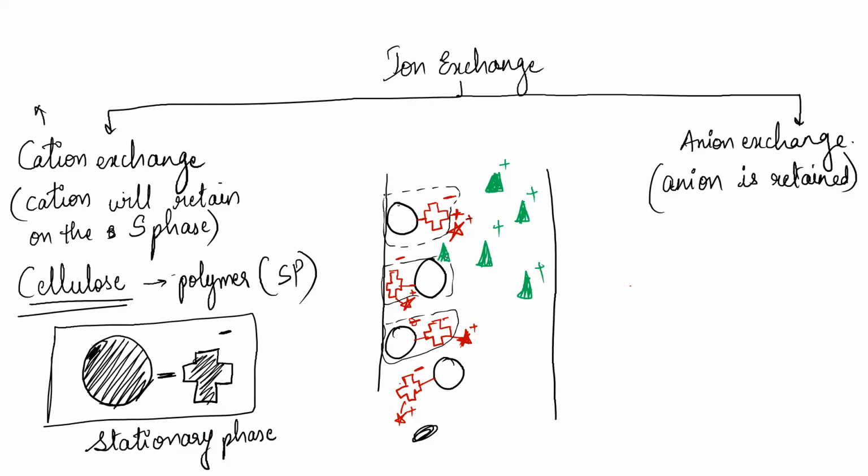Okay, and there are some other ions also along with the green triangles. There are other molecules, other ions, and let us say that the charge on them is negative. So it's going to be a mixture. I've given you a mixture of proteins, and they do not only contain a specific protein, they contain a lot of different things which carry charge.